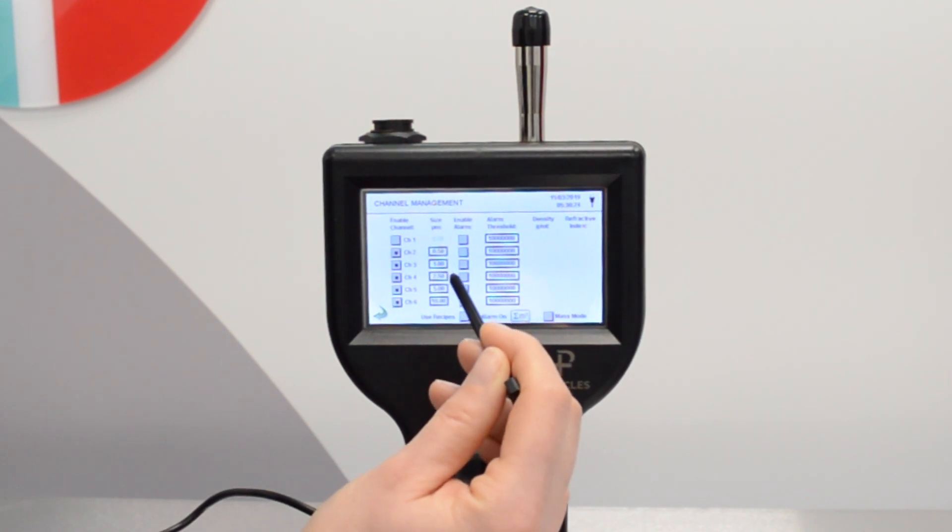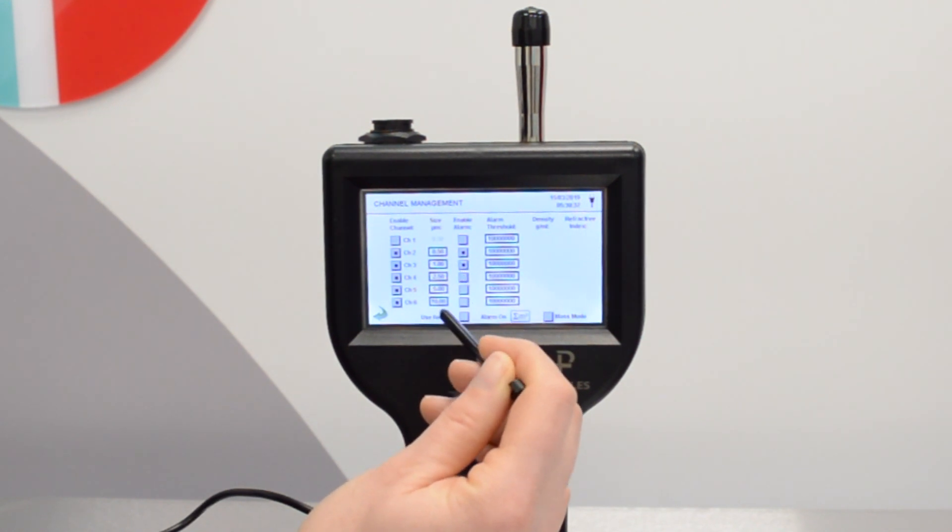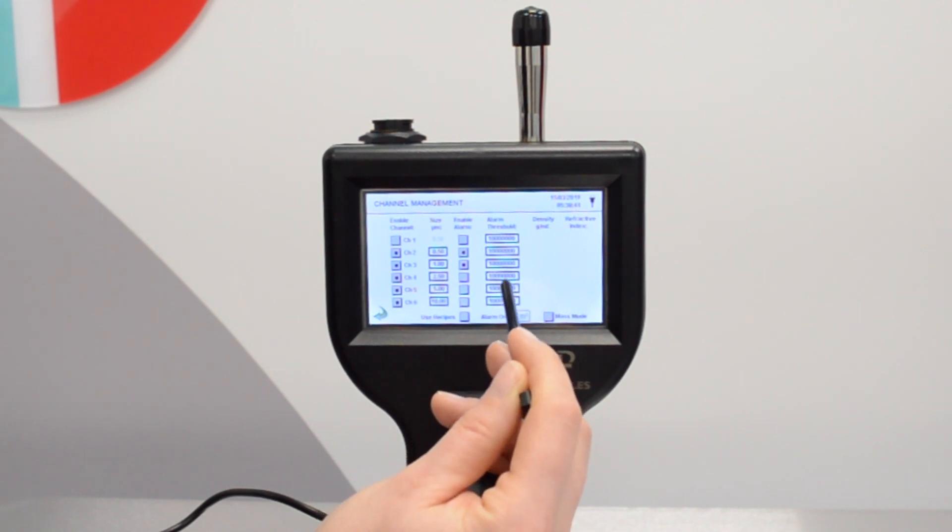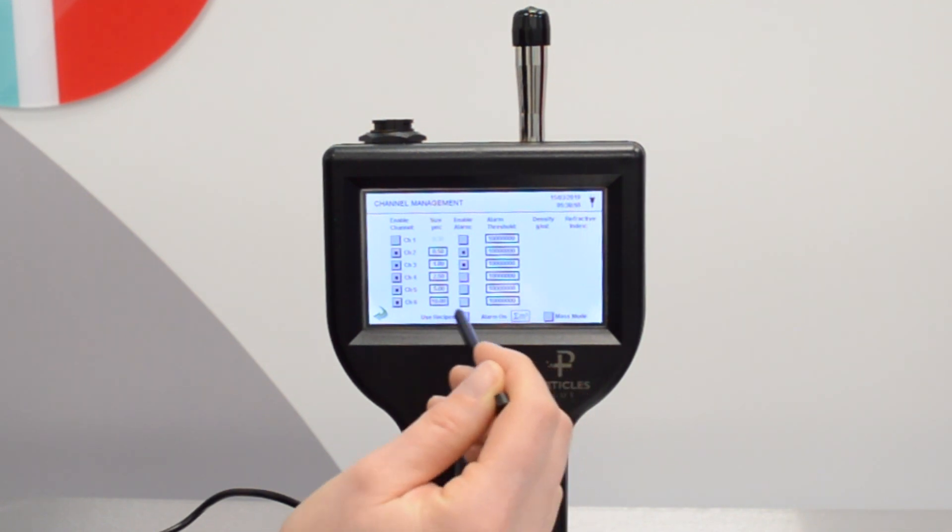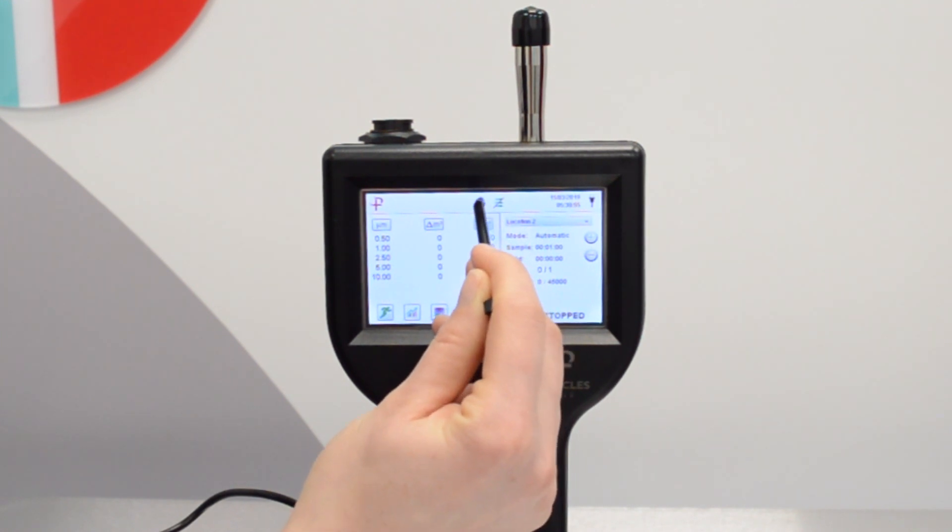In the enable alarm column you can select if you would like the unit to trigger an alarm if counts are hitting a threshold which you can set in the threshold column. This is great for continuous monitoring. There is a visible and audible alarm. The count numbers on the home screen will turn red and also the audible alarm will sound. You can select the unit which the threshold is set at so we would select cumulative cubic meter to be in line with the ISO standard. Back to the home screen and this is where you can change the volume.